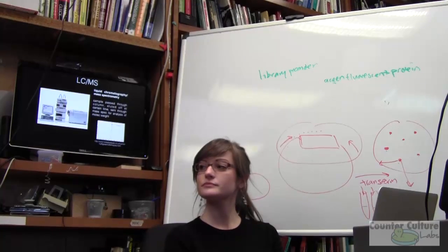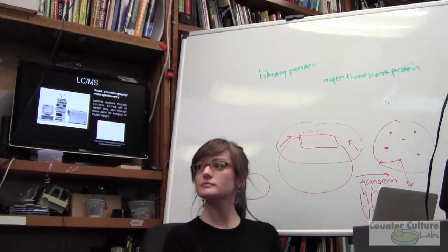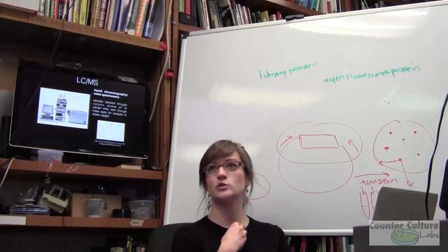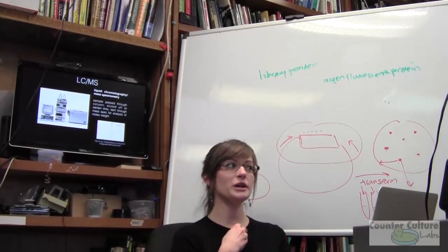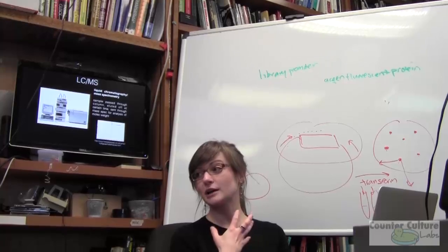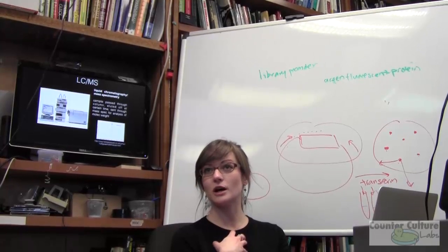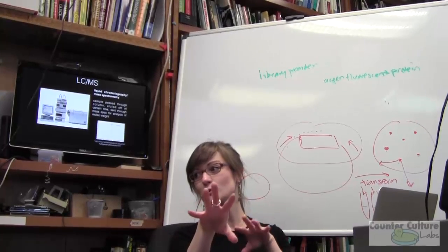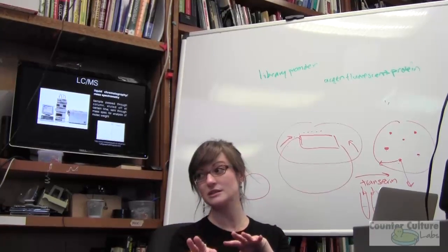At the same time, the separation happens in the column, not necessarily in the mass spec. The mass spec is the expensive instrument compared to the column, correct? Sure. But for instance, if I'm working with a compound that's really hydrophilic, and you need me to analyze a compound that's really hydrophobic, the mobile phase, or the program, or the ratios at which you put the hydrophilic phase versus the hydrophobic phase through are going to be different.